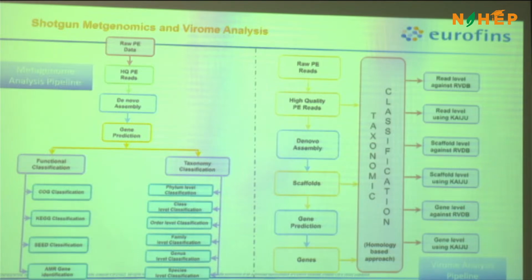In taxonomic classification, we again use databases. There are tools like Kaiju, and other tools where we can get the taxonomy. You can also do this whole metagenomics with the KRAKEN database. QIIME2 also does whole metagenome analysis. We can use that and use the databases which are available, or else we can do a BLAST against NCBI. If nothing is there, we can BLAST against NCBI and get the taxonomic information. So from phylum till species level, we get the taxonomic abundance of different bacteria or fungus based on what databases you are using.